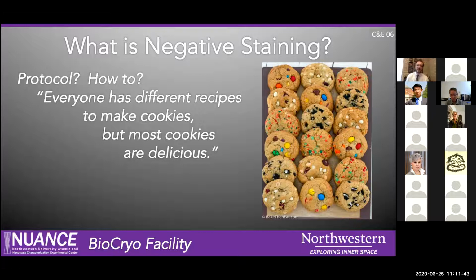It's funny because I've always done it differently. I don't wash the salt. Typically, I just drop cast the sample for less than a minute until I have my filter paper ready. I blot that off, and then I stain a couple times with uranyl acetate, let that sit for 4 minutes, and then blot it and let that dry for 4 minutes.